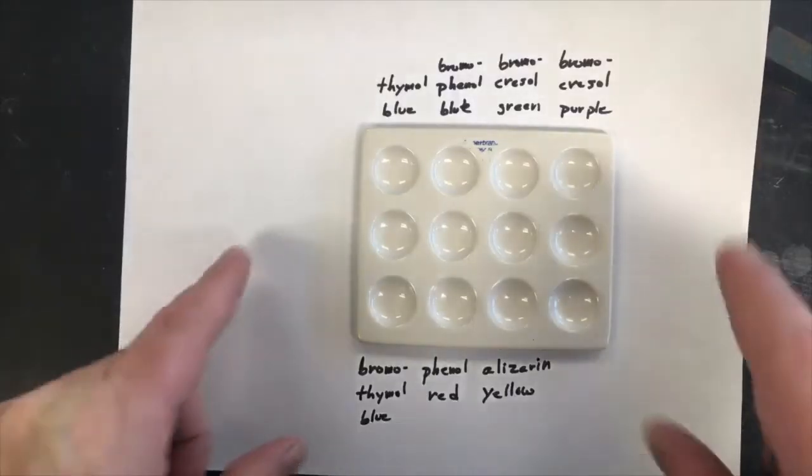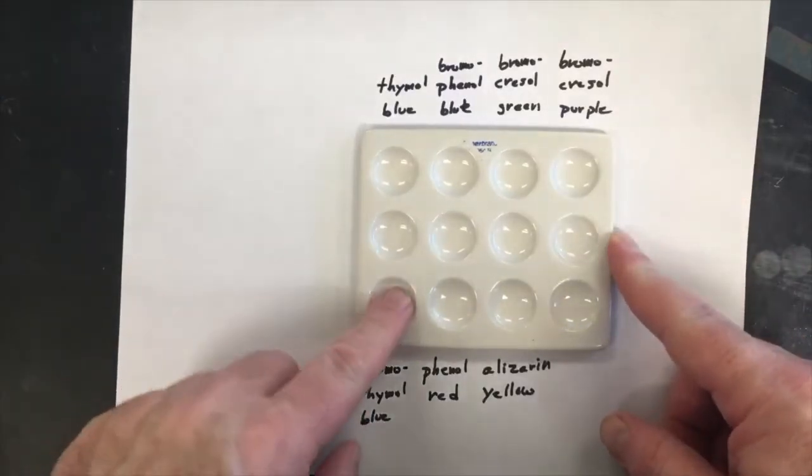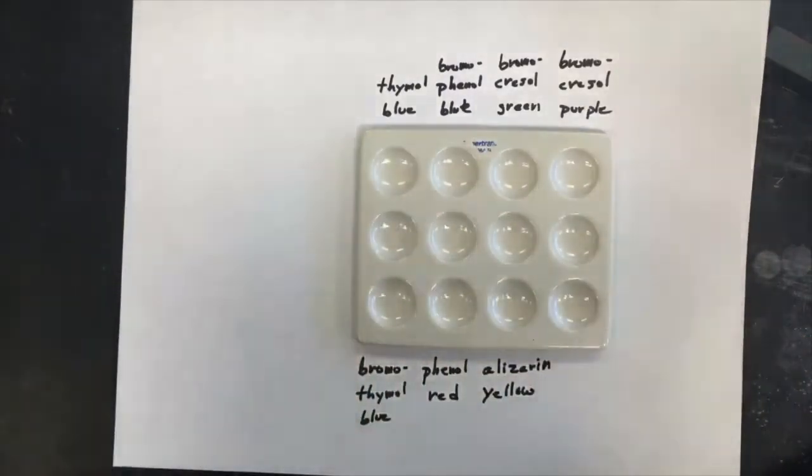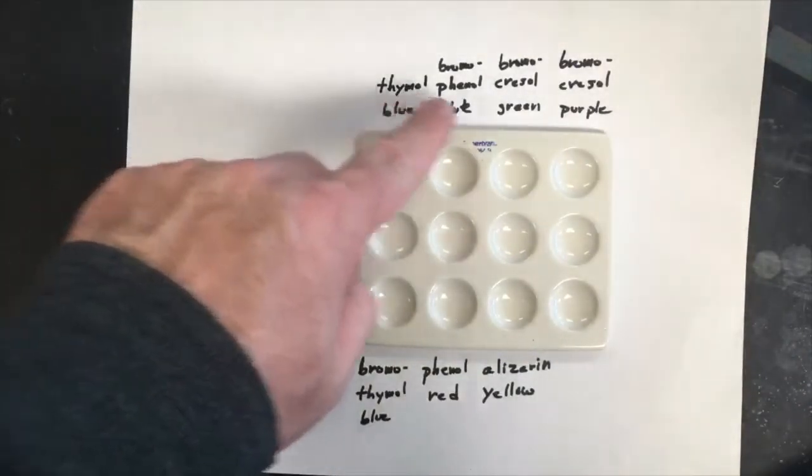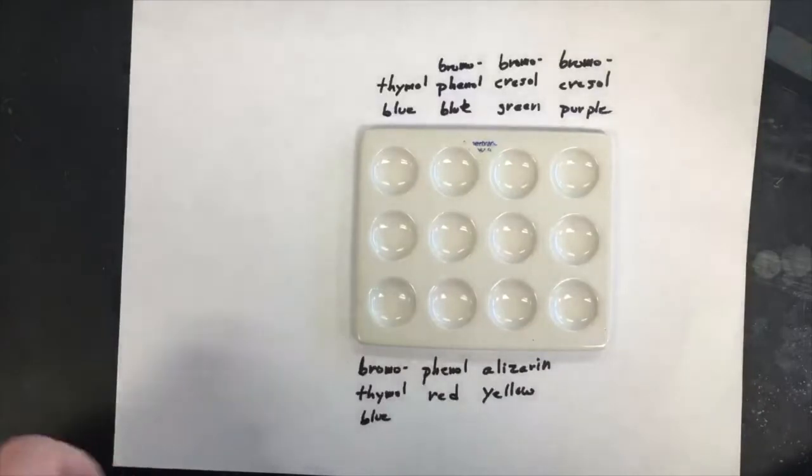So below us I have, this is called a spot plate and it has these indentations that I'm going to be mixing the indicator with the solution in it and I kind of labeled it along sort of next to the spots which indicator is going to go in. So I'm going to go through and do each of the solutions being tested one by one with all the indicators.